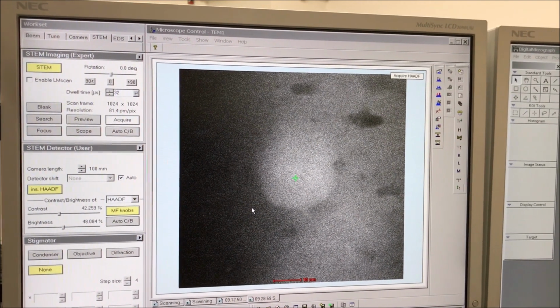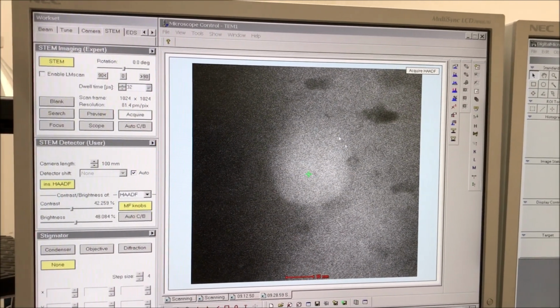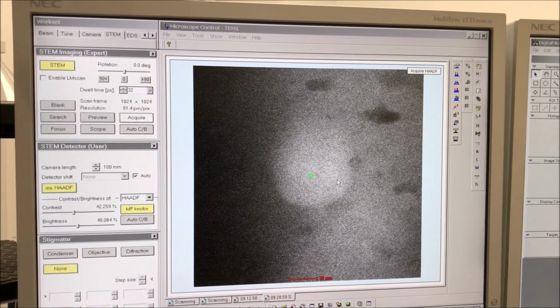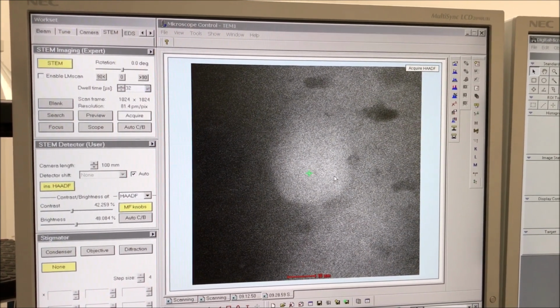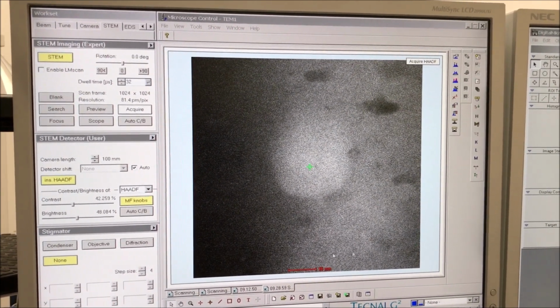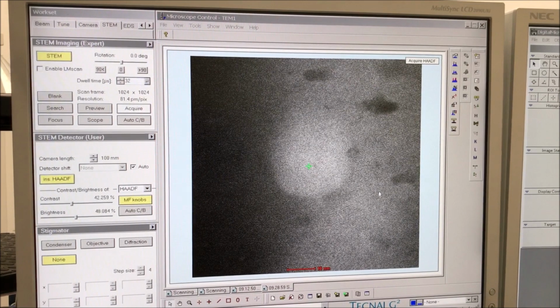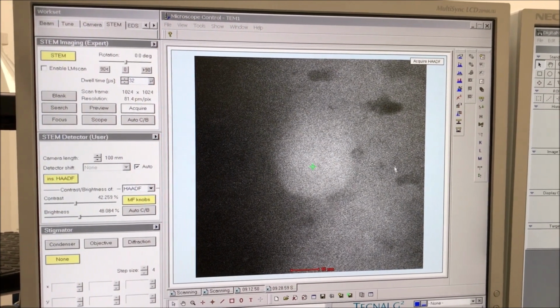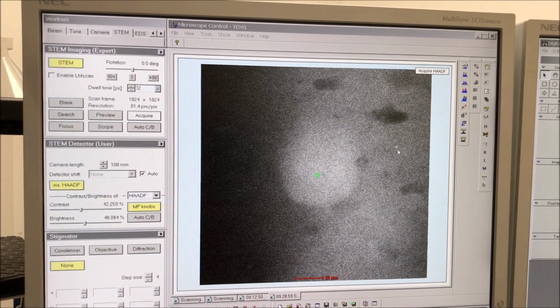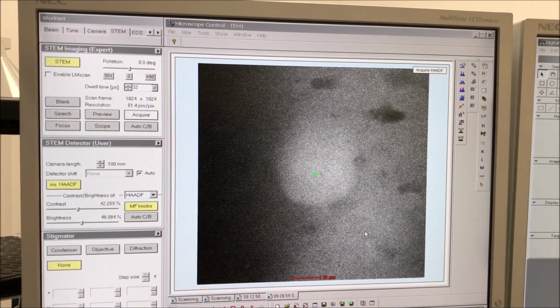All right, I finished the acquire. Again, you see this bright round buildup where I was imaging at a smaller field of view. It's a little hard to see because the field of view here is a little bit larger, but I can see atomic res detail out here where I wasn't imaging before, where I don't have the same contamination buildup.